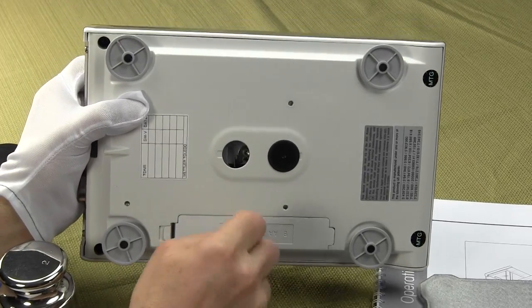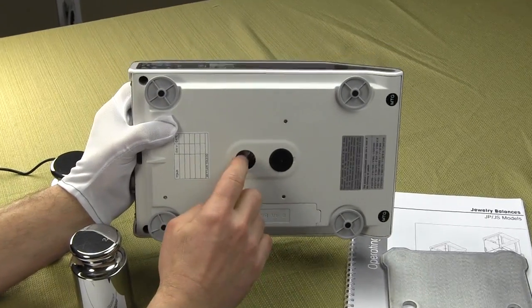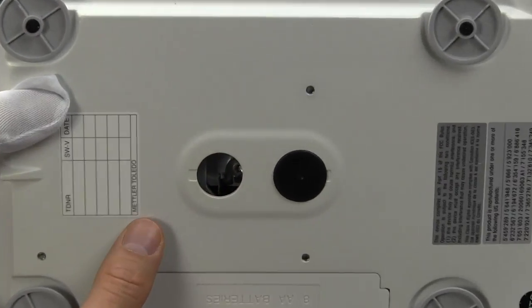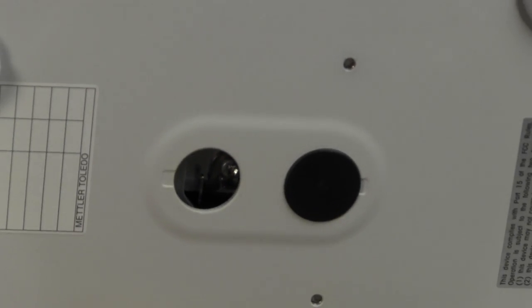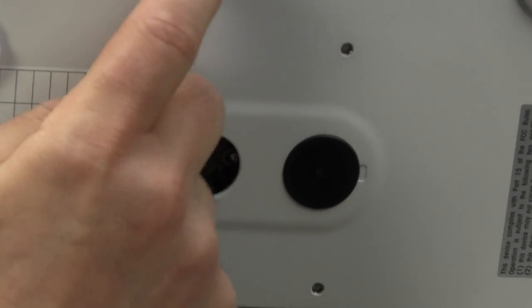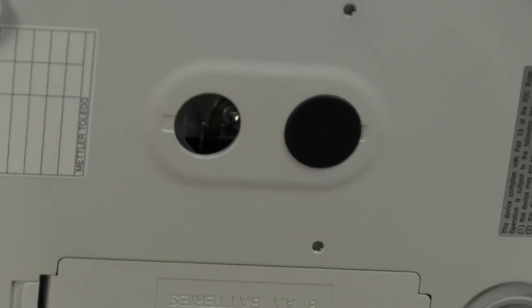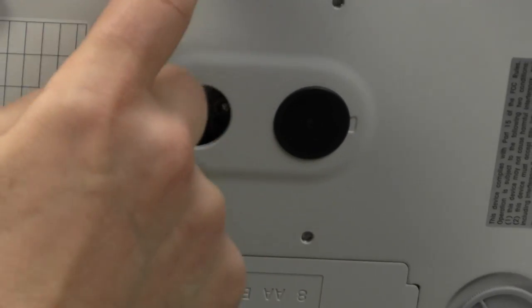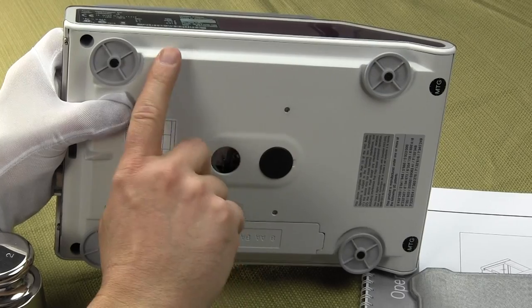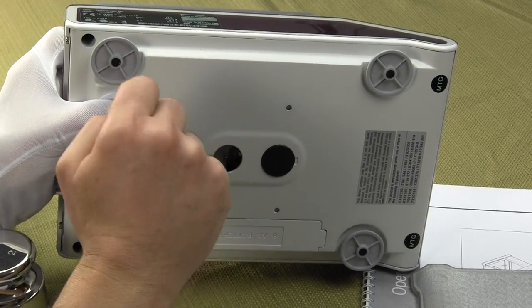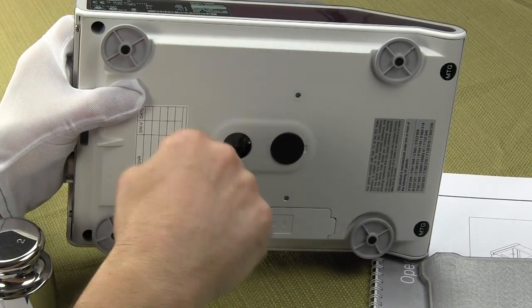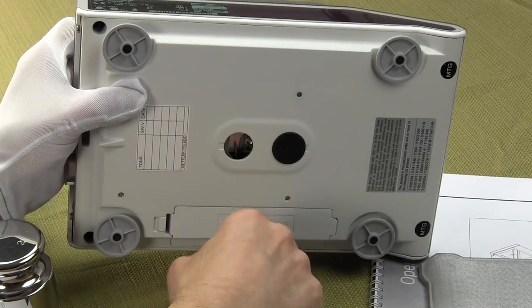If you look in here, there's a little tiny spot where you can hang a wire. Now, on the Mettler Toledo, this is all cast aluminum. High grade, die cast aluminum housing. A lot of balances on the market, you'll see a plastic. Mettler Toledo, they do it right. This is all cast aluminum.